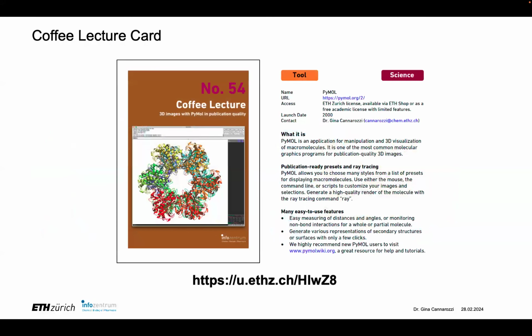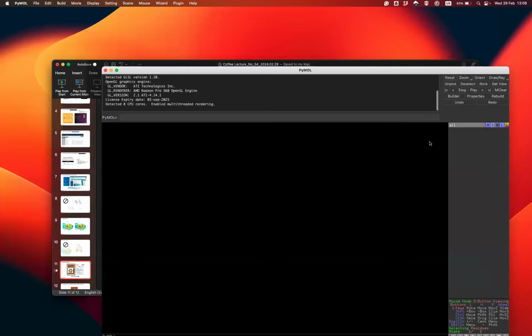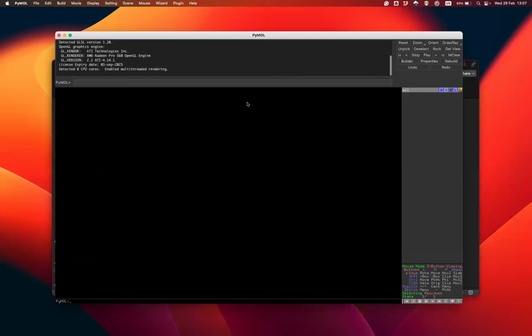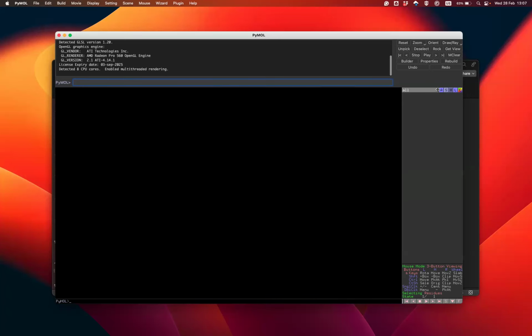Okay, so now I would like to do a demonstration of PyMol. However, my mouse isn't working, so we'll see if this works. So this is the PyMol interpreter. You can see over here, I have a command line. I can go directly to the PDB and collect something from there. I have an object viewer over here, and I wanted to show first the demonstrations.